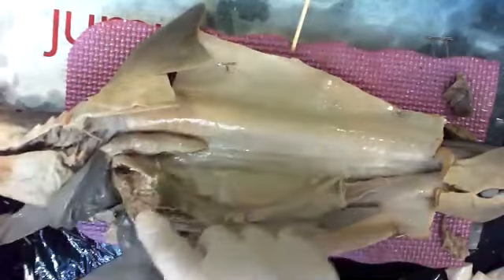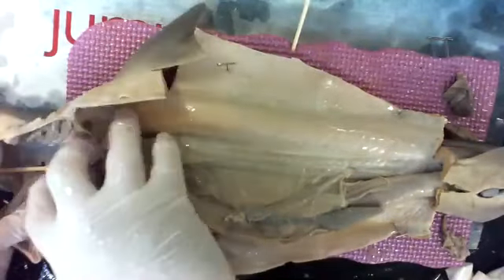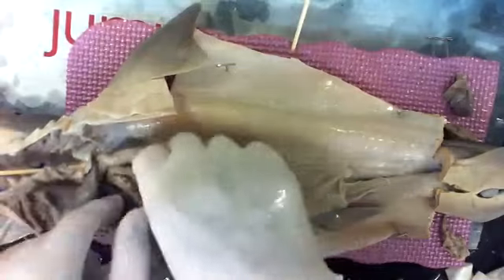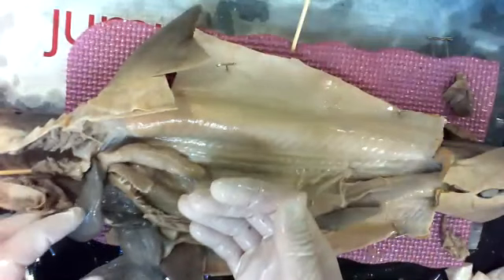That's esophagus. So when a fish goes in here, starts moving down, the grip at the back of the mouth, the grip that feels like a cat's tongue back here at the back of its tongue, these little finger-like projections, they all kind of squeeze in and trap so the fish doesn't come back out unless it is pushed back out.